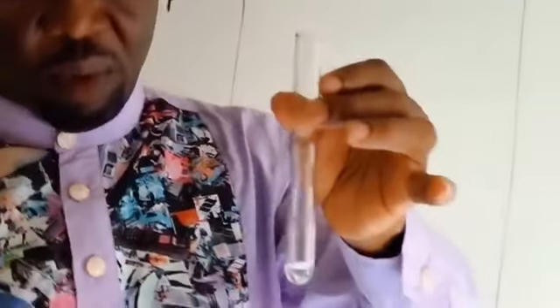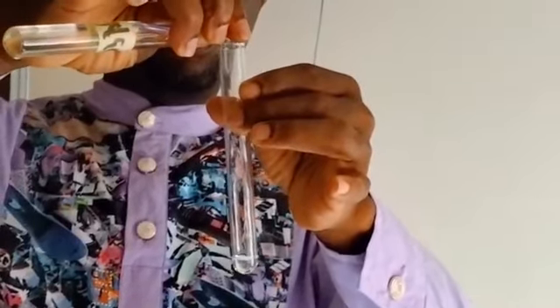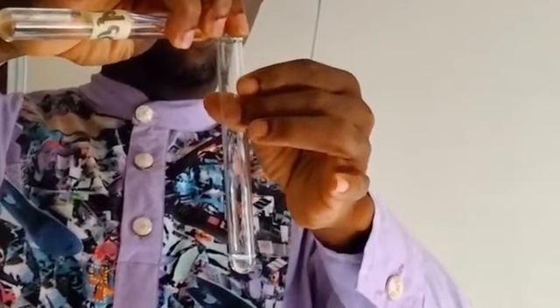Then we are now going to add sodium hydroxide, NaOH, freshly prepared. We're going to add it in drops, a little amount of it into this place. Just a drop. You can use the dropping pipette, or just add a little amount of it into it.